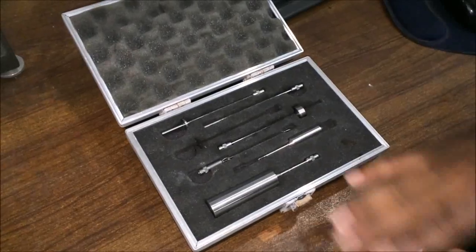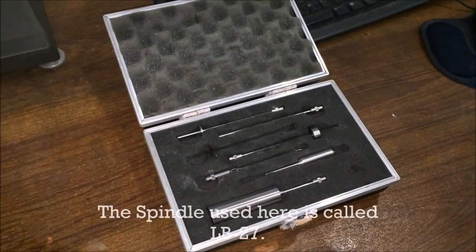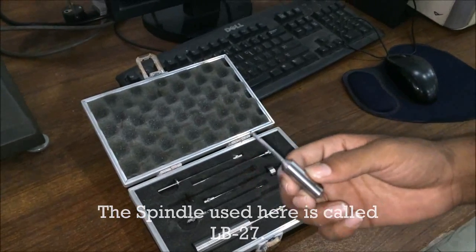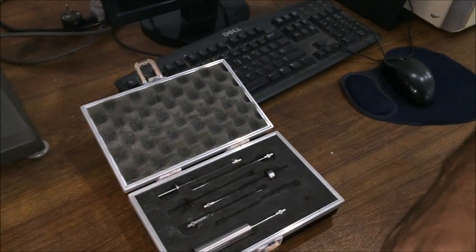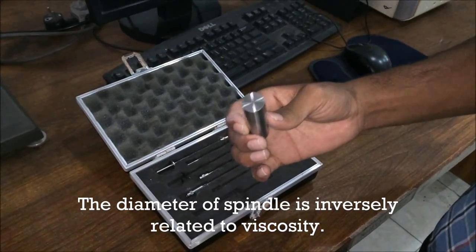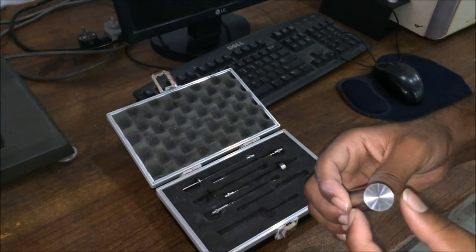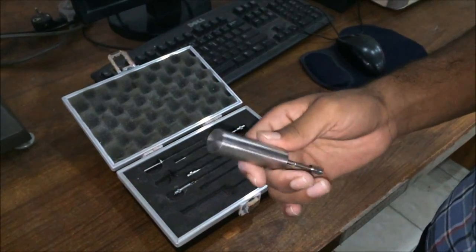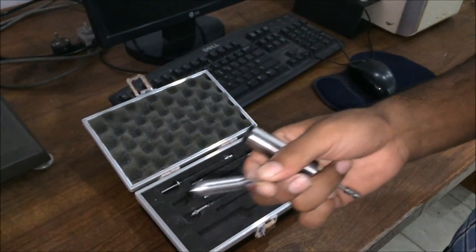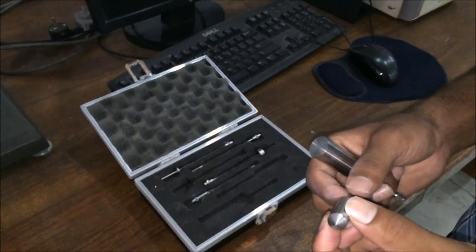You can see these are the different types of spindles having different diameters. In our experiment we are using the LV27 spindle for measuring the viscosity of our fluid. One important point: spindle diameter has an inverse relation with the viscosity of a fluid. The larger-diameter spindle is used mostly for measuring the viscosity of water, while for our gelatin we are using the LV27 spindle.